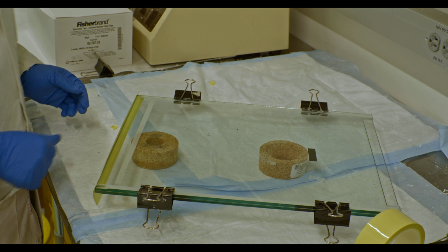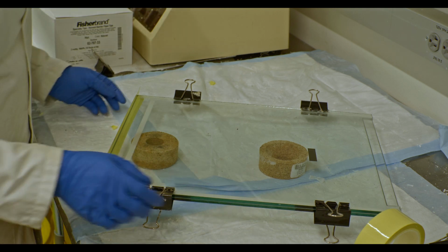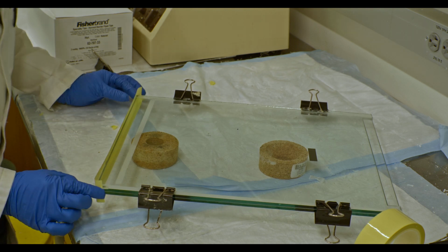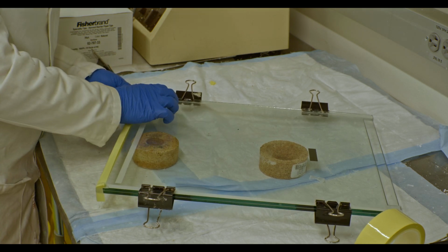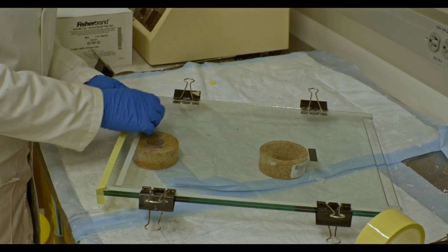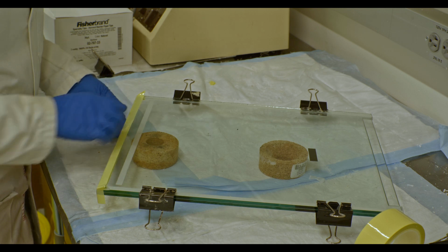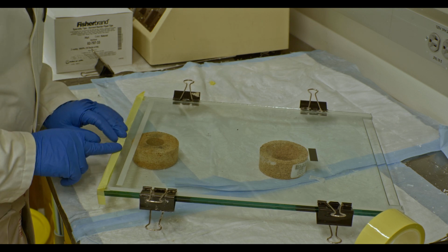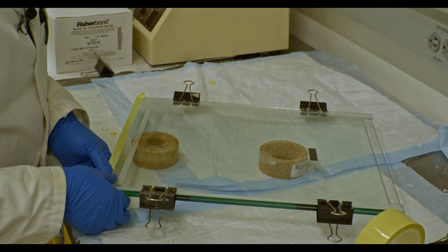And then on the edges, do the same thing. Run your finger along right there. Once the edges are nice and sealed, you can then start to push on top. Make sure that you start with one end and rub from the bottom towards the top, like so. Make sure you have as very small bubbles as possible. You don't want those bubbles. Bubbles are your enemy. But again, as long as that bottom layer is nicely sealed, it doesn't matter too much about the bottom.